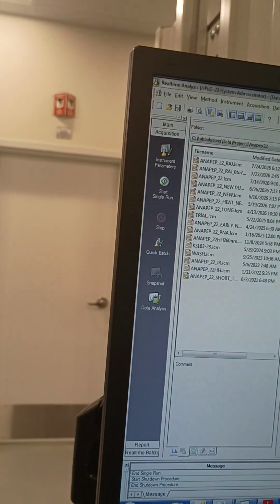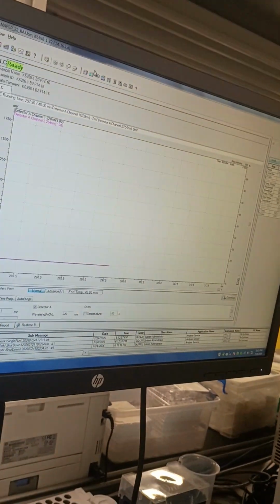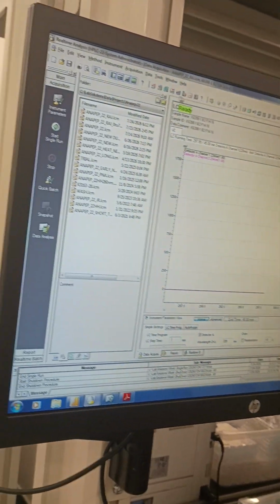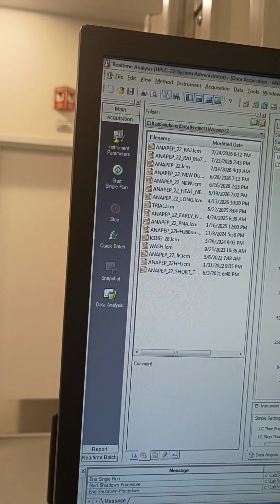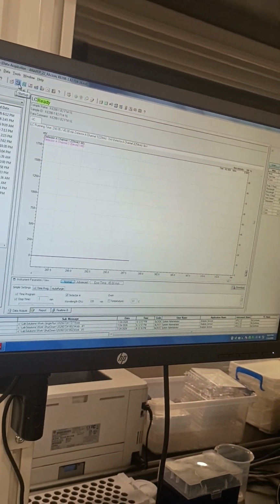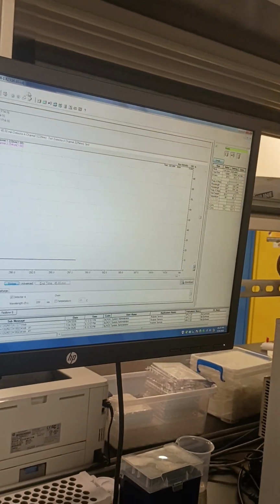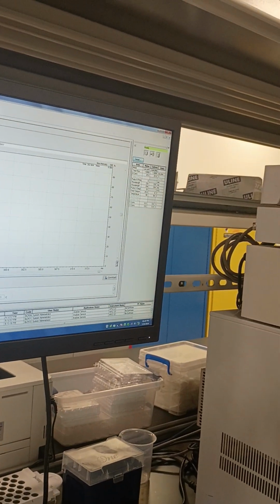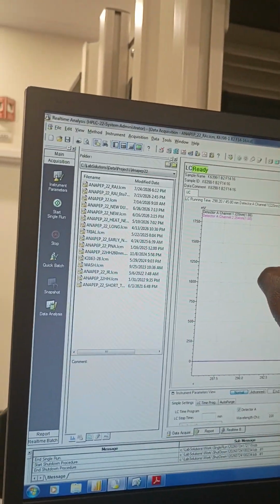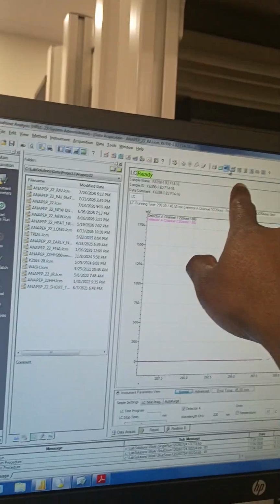And this is your pump on, pump off. Sometimes if you press this button, the green button, that's going to turn everything on too. First the yellow one, this one right here, that's the shutdown. No, this one will turn your pump on. This one or this one, these two will turn your pump on.